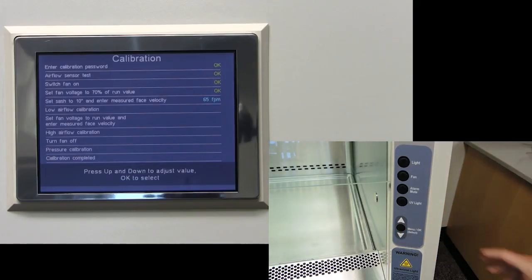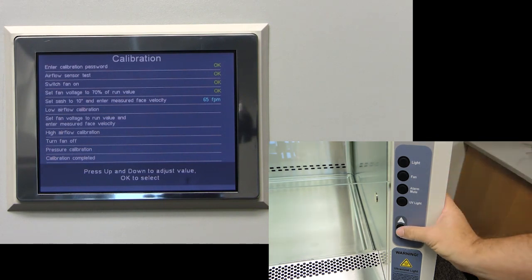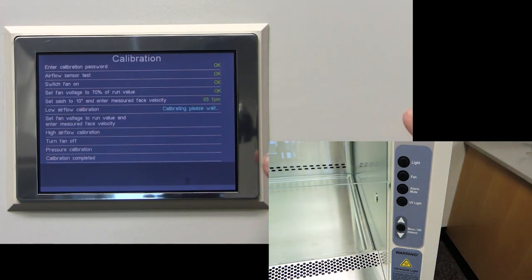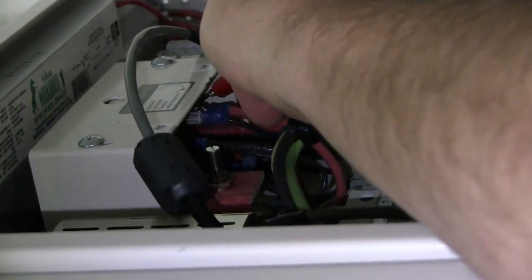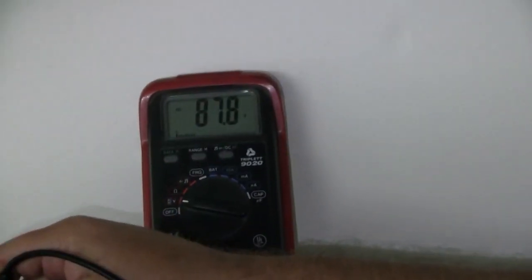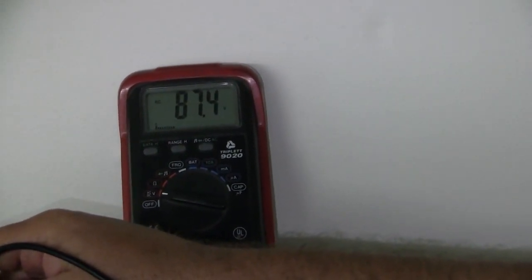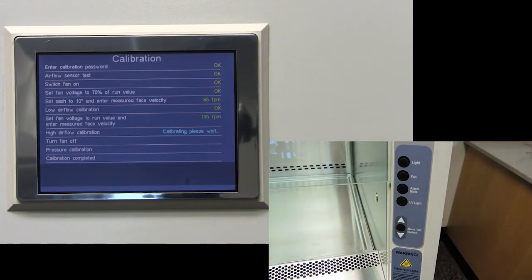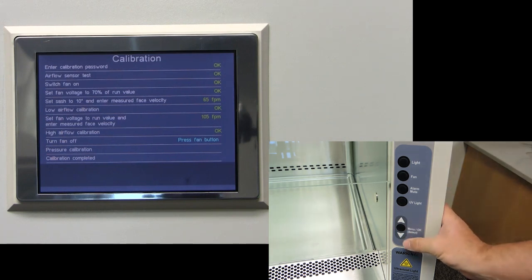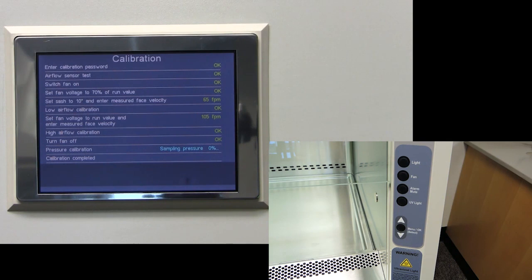Press the menu slash OK button on the front of the hood to move to the next step. Press menu slash OK again and allow the screen to calibrate. Then increase your fan speed until your voltage is back at your original run value amount. Allow the cabinet to stabilize for 3 minutes. Press menu slash OK again to run a high airflow calibration. Turn off the fan; it will then sample the pressure and finish calibrating.